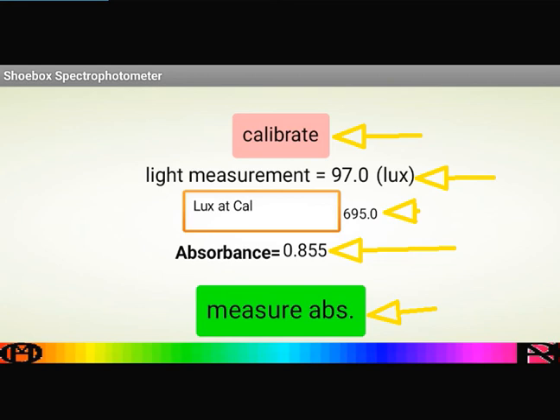different means of diffraction and different slit widths in the sample holder. There's a lot of scope here to play around with it and improve it and make it good for a specific reason that you might want to use a spectrophotometer.